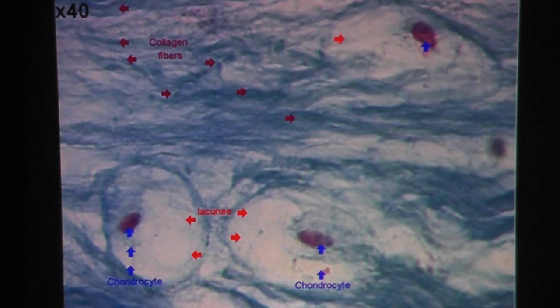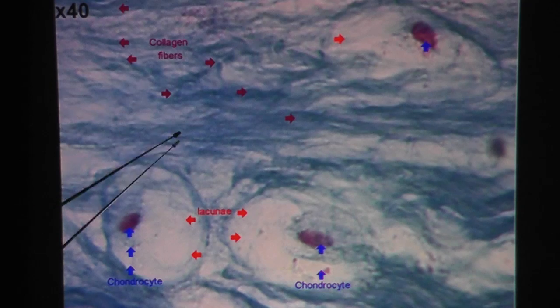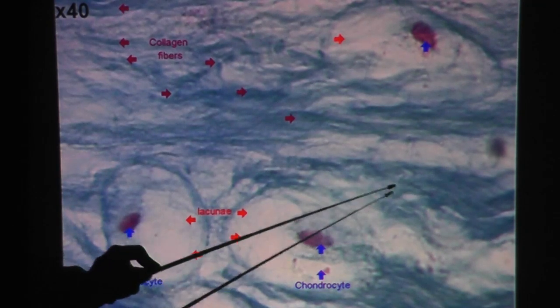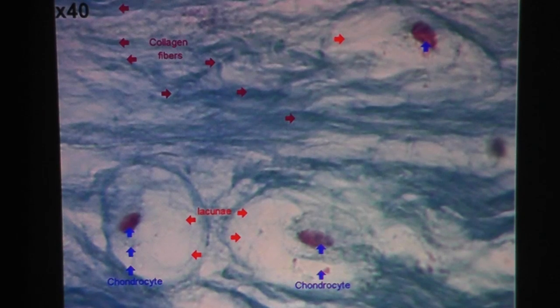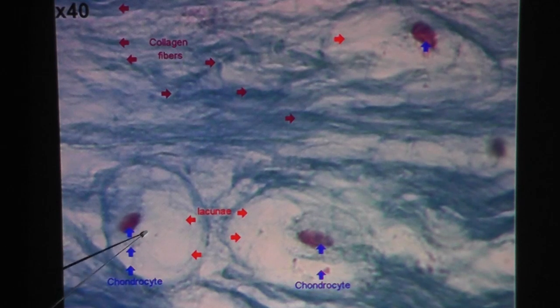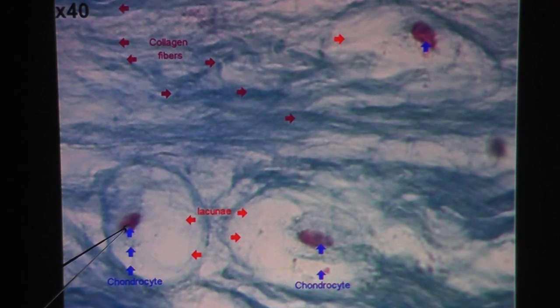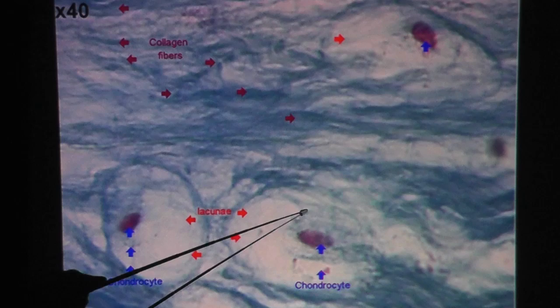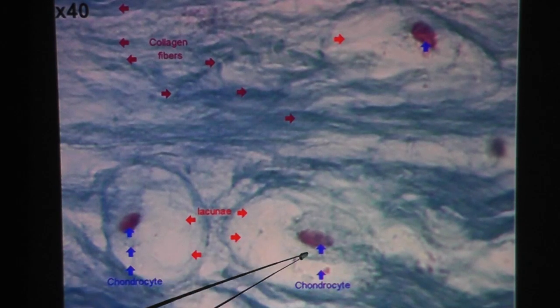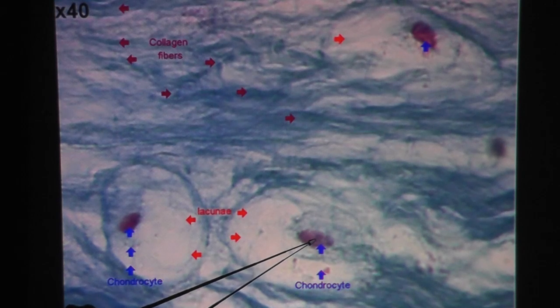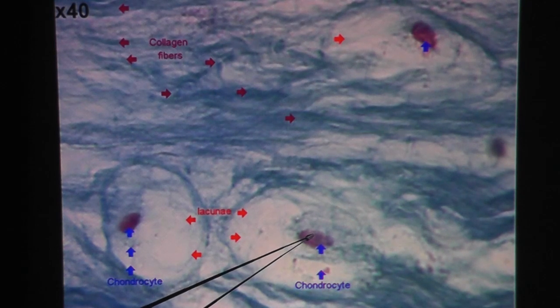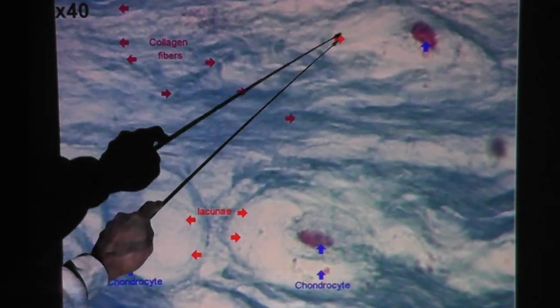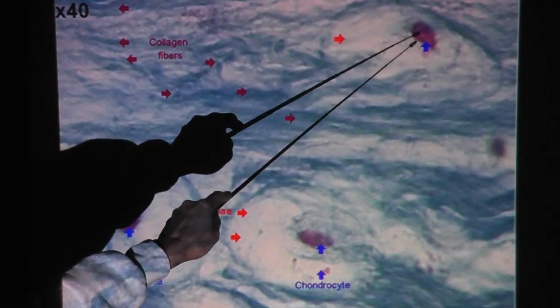This is a very high-power view of fibrocartilage. Here you can see the matrix and the waviness of the collagen fiber. This is one large lacuna, and inside this lacuna we see a chondrocyte. That dark roundish area is probably the nucleus of the chondrocyte. Here's another lacuna, and in this lacuna we see a chondrocyte. The bluish stuff is probably the cytoplasm, and that round oval structure is probably the nucleus of this chondrocyte.